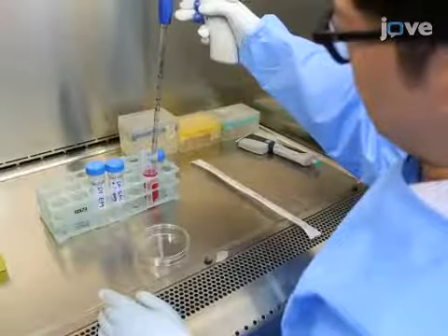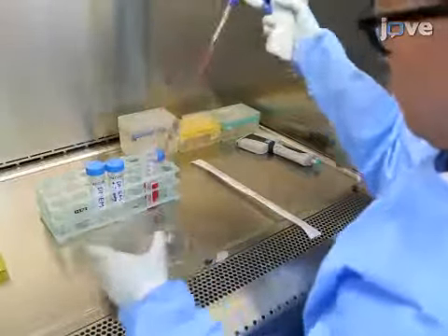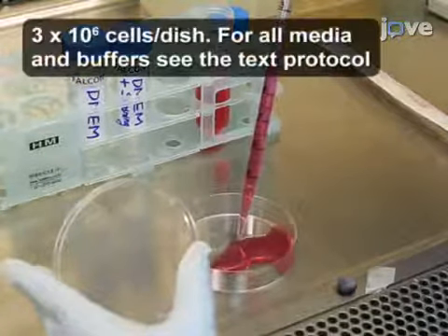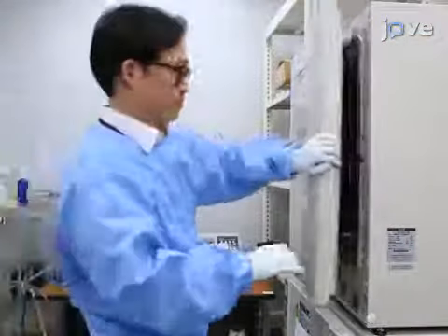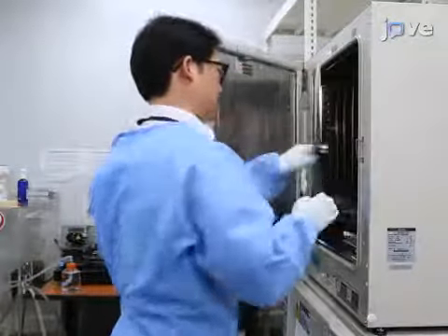To start virus production, prior to plasmid transfection, split HEK293 T cells at 30 to 40% confluence in a 10 cm tissue culture dish in 10 milliliters of cell culture medium. Incubate the culture plate in a 5% carbon dioxide incubator at 37 degrees Celsius overnight.